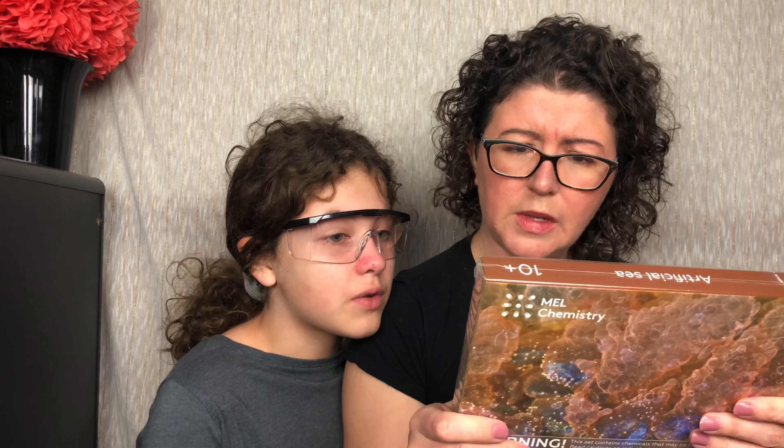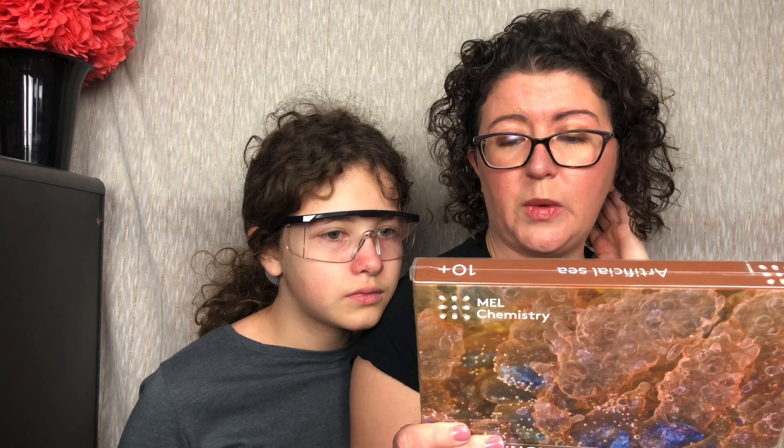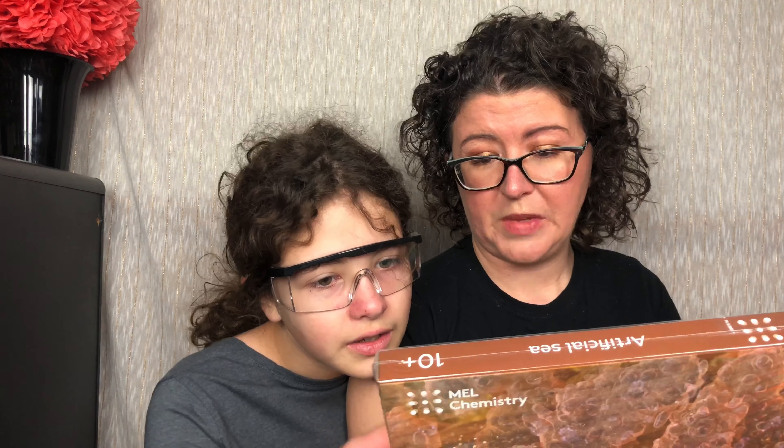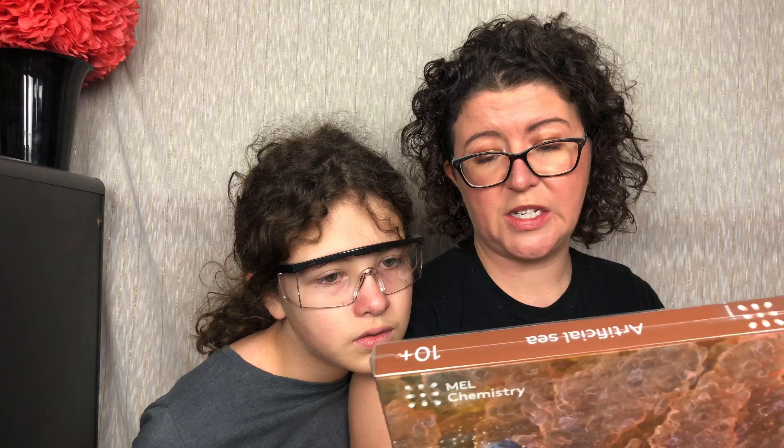So this is the other kit that was sent - this is another science kit, so we have two kits to do. This is the 'Artificial Seed' kit for ages 10 plus. I think I might have done one of these before. Chemical jellyfish and then chemical seaweed. In this set we receive: manganese sulfate, copper sulfate, iron chloride, iron sulfate, liquid glass, potassium hexacyanoferrate, zinc sulfate, petri dish, double-ended measuring spoon, pin opener, protective gloves, wooden stick, experiment card, and instructions. It shows you what you'll be taking from your starter kit, so we can't lose any of that stuff.